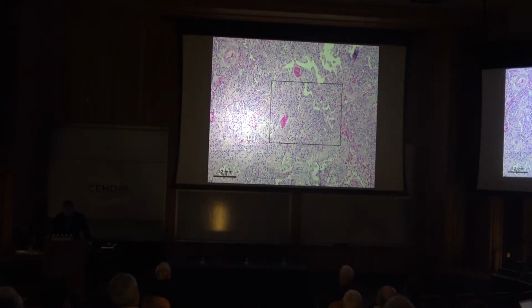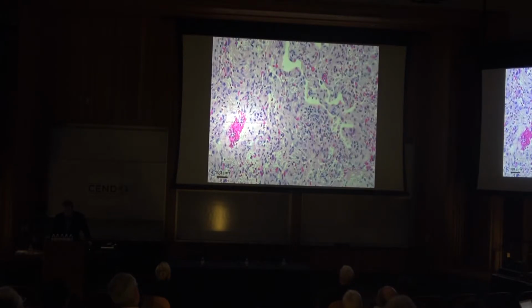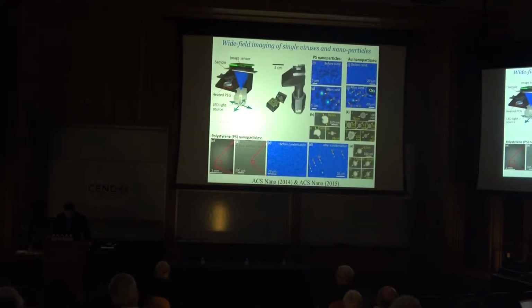You have there, as I said, almost diffraction limited resolution, which means effectively the pixel size here can be as small as about 200 nanometers, even with using CMOS images that have 1 to 2 micron pixel size. This is a framework called pixel super resolution that's giving us, from let's say a 10 megapixel imager, 20 megapixel imager, approximately 1 billion useful pixels across a very large field of view.